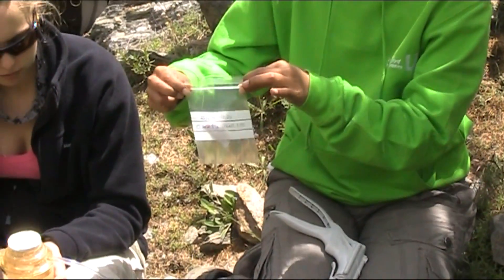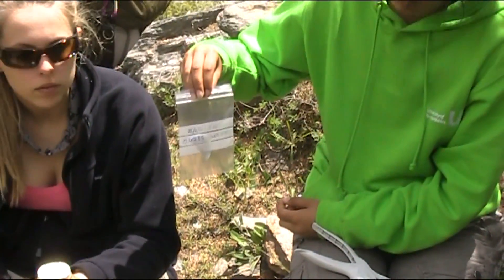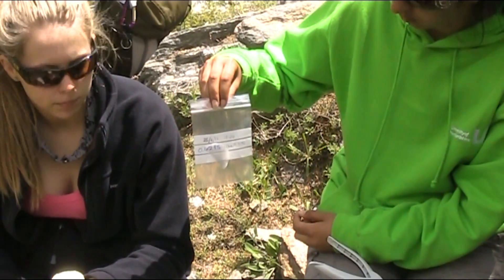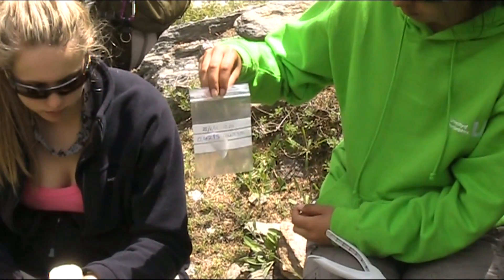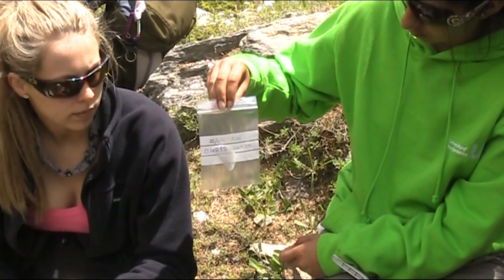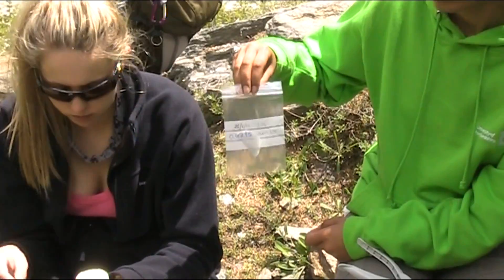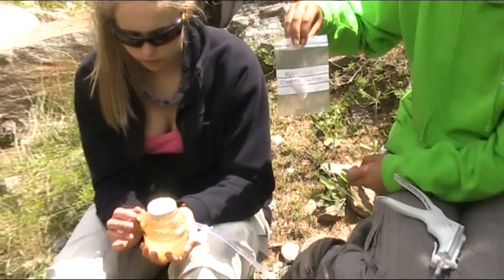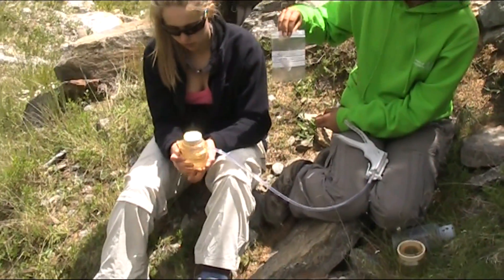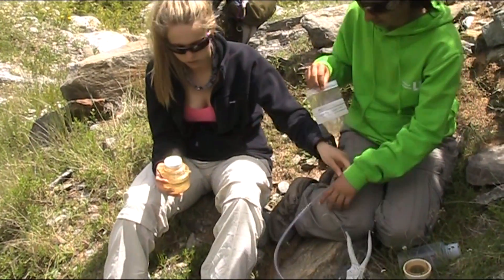Back in the lab the filter paper will be dried and then weighed, and compared to its original unladen weight without any sediment on it, which we have written on the bag. We know we've used 200ml of water, so we can work out how many grams or milligrams per litre are in this sample. Then it's simply a case of discarding the filtrate from the lower chamber, and we're ready to filter our next sample.